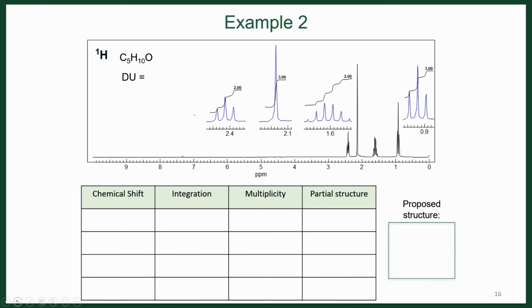So let's look at one that has a little bit more signals associated with it. And so I'll just pause here for a second to allow you to draw out your NMR table, so you can hit the pause button so that you can follow along and maybe do this ahead of time before you watch the analysis that I'm going to do. All right, so hopefully you're coming back and you're ready with your NMR table to go through here.